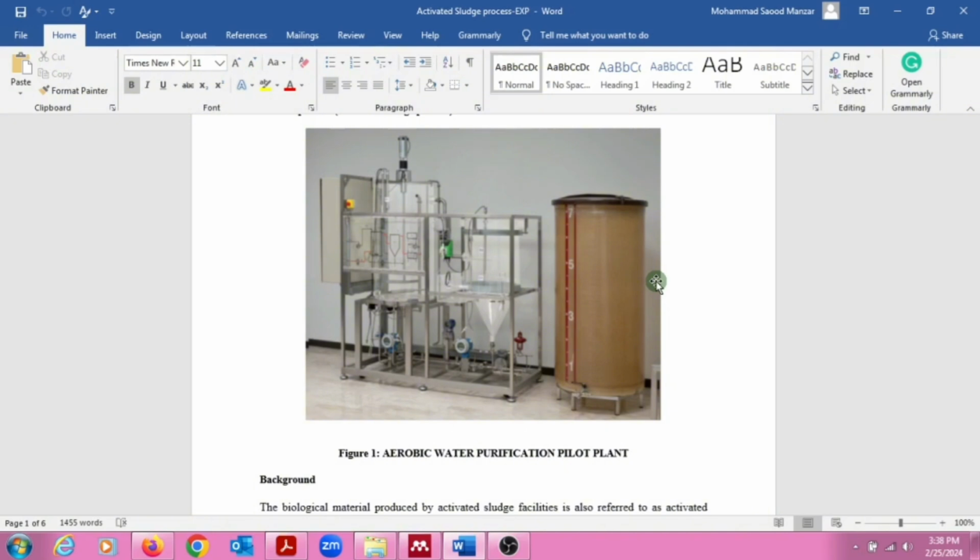Now, the efficiency and size of the biological clarification system depend on three factors: first, the speed of the biological reaction, which is a first order reaction; second, the bacteriological biomass in the process, which is the amount of microbial mass in the system, in the form of MLSS; and third, the contact time, the hydraulic retention time, which is around 6 to 8 hours between the solid substrate and the bacteriological biomass. Okay, and the solids retention time is completely analogous to HRT. So HRT is the hydraulic retention time and SRT is the solids retention time. Usually the HRT is in the order of hours and SRT is in the order of days. To achieve this, the microorganisms are recycled from the clarifier over and over again.